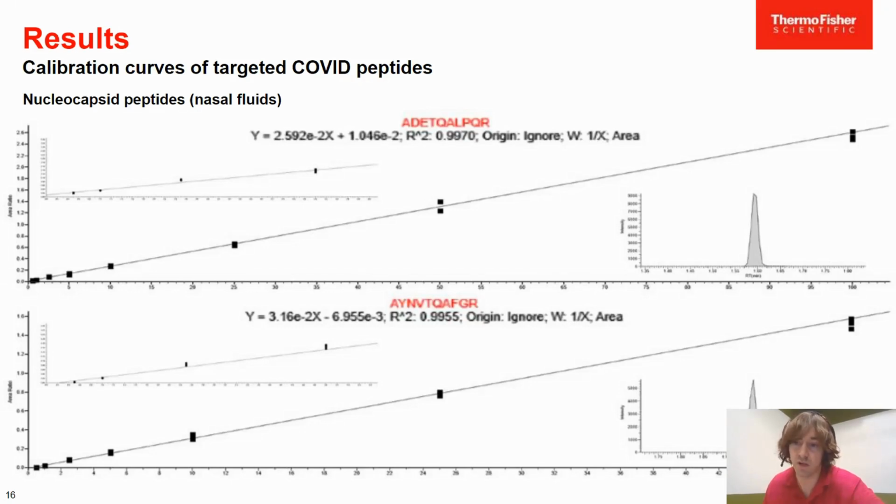TraceFinder software was able to use these calibrants to produce calibration curves that were then used to determine limits of quantitation. Concentrations not meeting the limits of detection were discarded, and then the next lowest concentration would be discarded until a specific criteria were met. These included data providing a close fit to the line with an R² of greater than 0.99, and every calibrant achieving RSDs and CVs of less than 15%. Each of our 6 targets were demonstrated to be absolutely quantifiable, down to either sub or low femtomole on column limits.